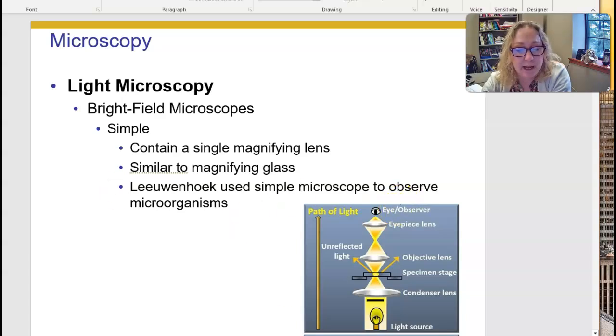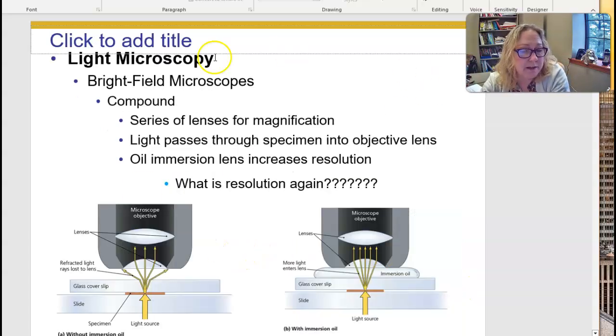Okay? So again, how your microscope works. You're putting light here, then the light condenses it. Do you want it in a tiny spot or do you want more light? Depends on how dark. We're going to do a negative stain, and that thing is super dark, so you're going to want all the light in all the places so that you can see it. If you have tiny little bacteria that are lightly stained, you're not going to want a ton of light on them or you aren't going to be able to see them. So that is all the light microscope.